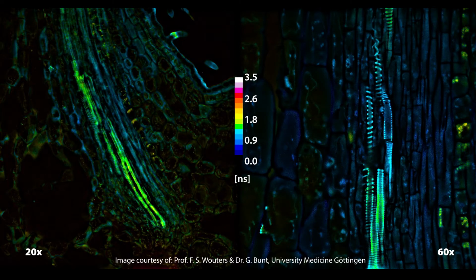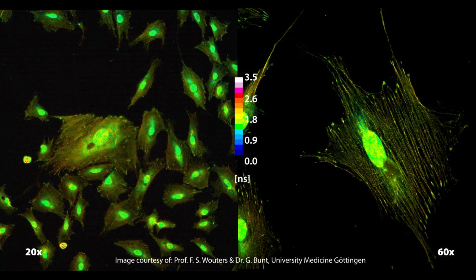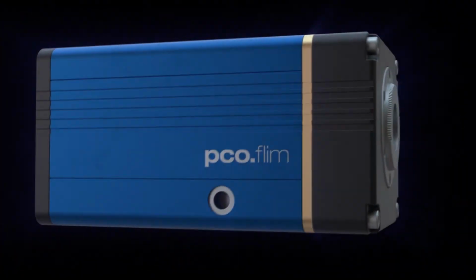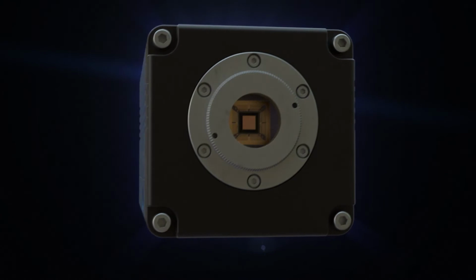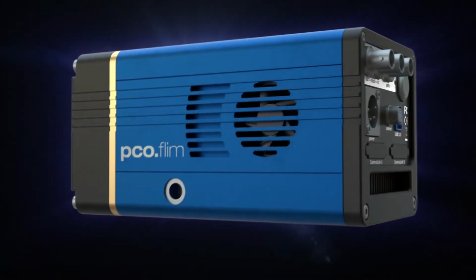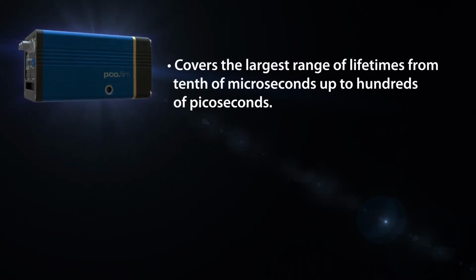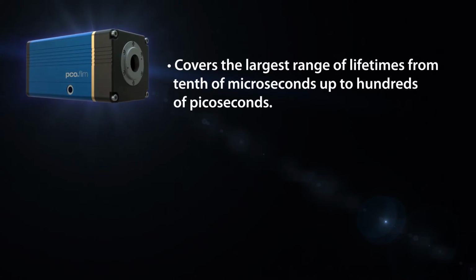So this is what makes the PCO FLIM camera a versatile frequency domain FLIM system. It can be used for the measurements of a huge range of luminescence lifetimes from tenths of microseconds down to 100 picoseconds. The PCO frequency domain FLIM system is best in its class because it covers the largest range of lifetimes from tenths of microseconds up to hundreds of picoseconds.